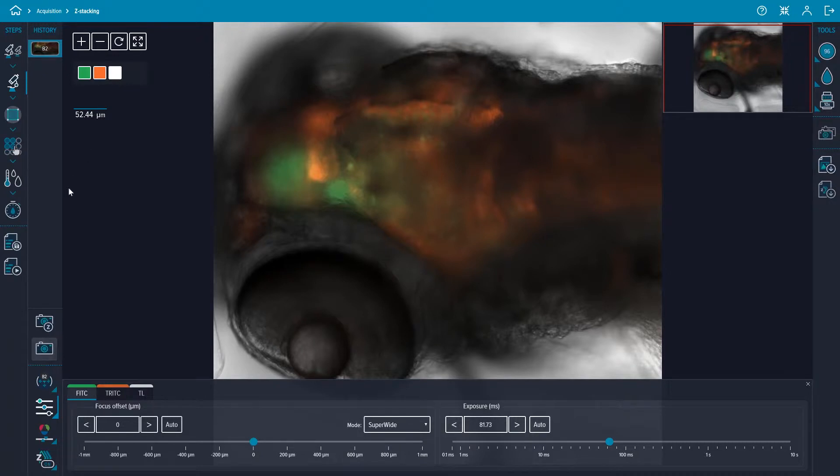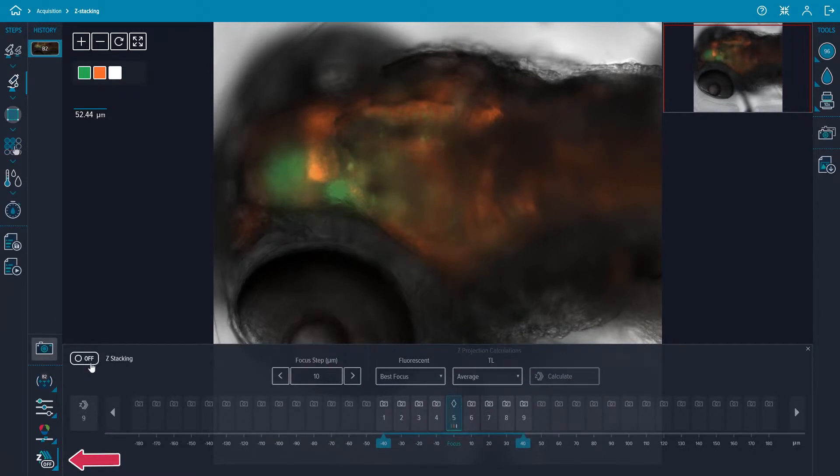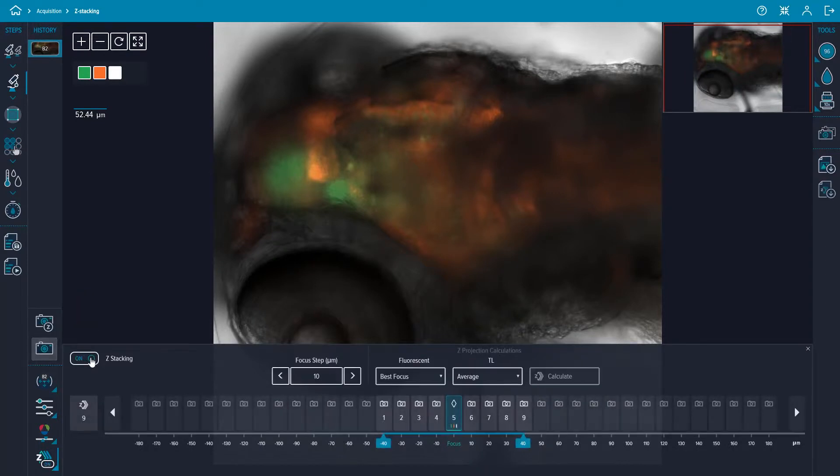To view the z-stacking option, click on the z-stacking icon. By default the z-stacking option is turned off and the bottom pane sets z-stacking to on.